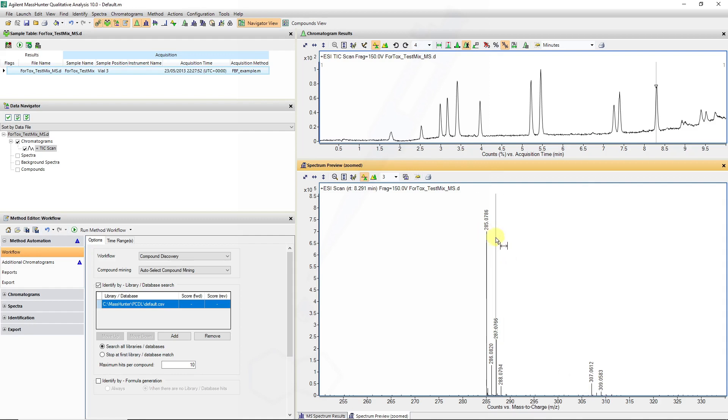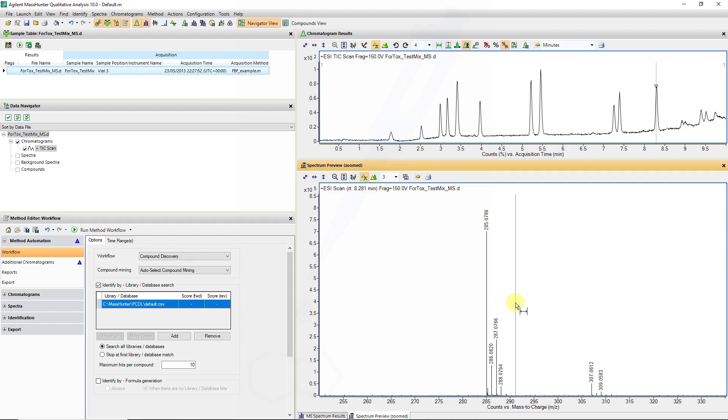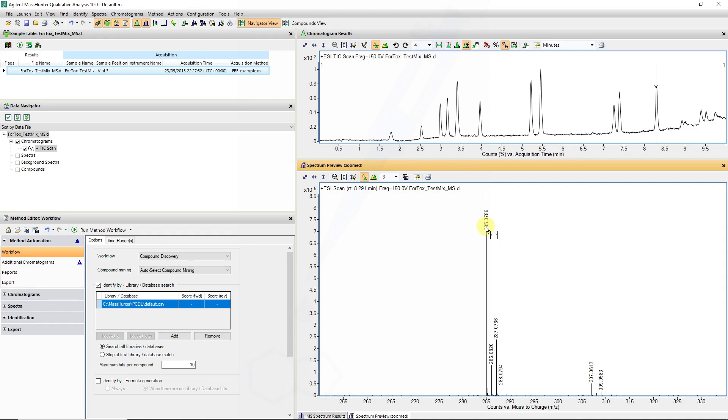The problem we might run into, especially when dealing with large databases, is that we often have molecules with the same chemical formula. We would need to get additional information, either on fragmentation patterns of this particular molecule, to gain confidence on what the structure really looks like.